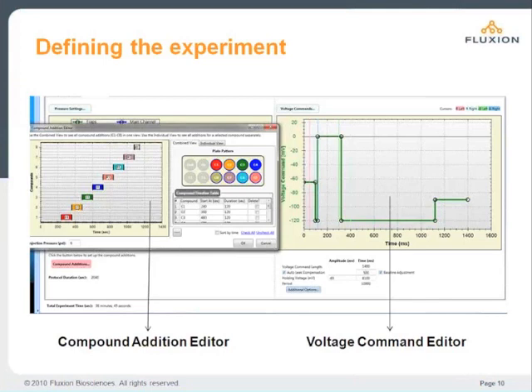It will be either the low concentration of lidocaine or the low concentration of A803-467, or, for the negative controls, only buffer. In a similar fashion, the C3 to C7 applications will occur, each lasting for 2 minutes. And then finally, the C8 application, which in this case is once again only buffer, will last for a minute. The entire experiment will take about 20 minutes to run.